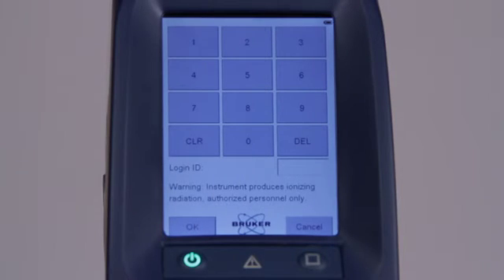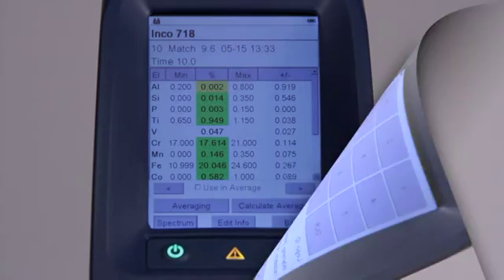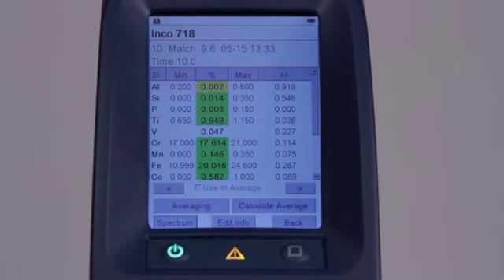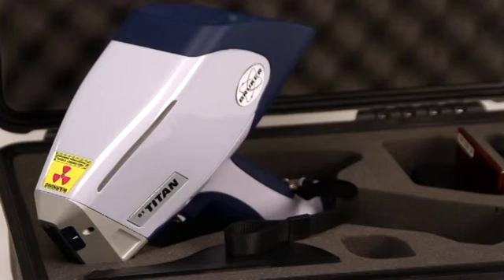If the instrument is unused for about 10 minutes, the password screen will appear. To restart the analyzer, simply input the instrument password. The analyzer will return to exactly the same state that it was in when the timeout occurred. If the instrument is unused for about 15 minutes, the screen will shut off and enters a standby mode to save power. Tap the screen to reactivate the display and then enter the password. This timeout is part of the safety precaution — if the analyzer is left sitting, an untrained person cannot operate the instrument.